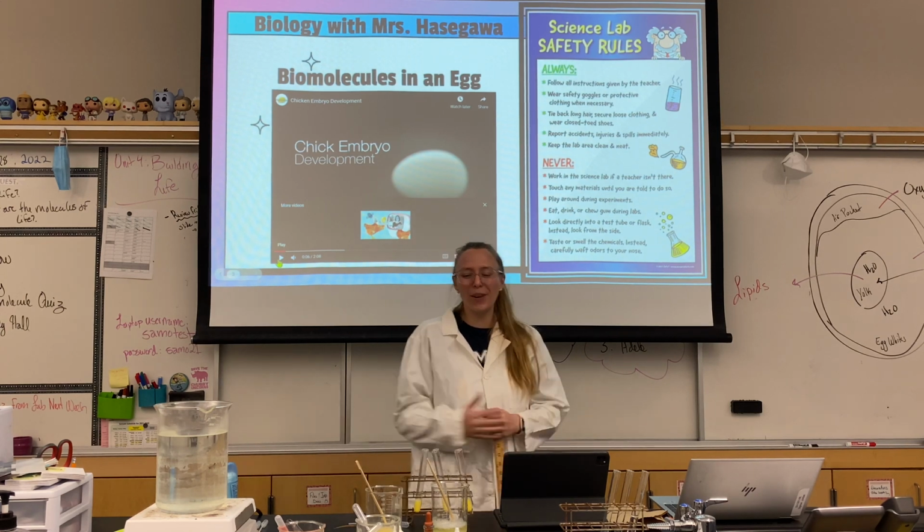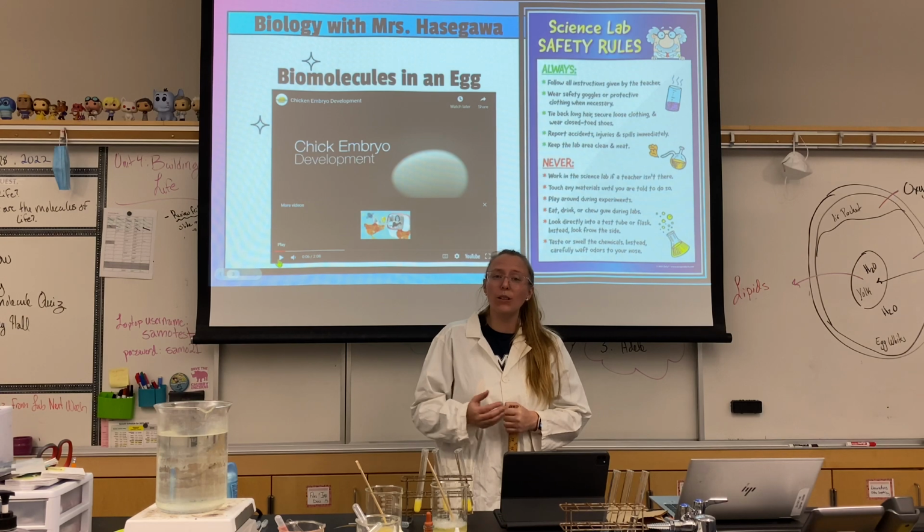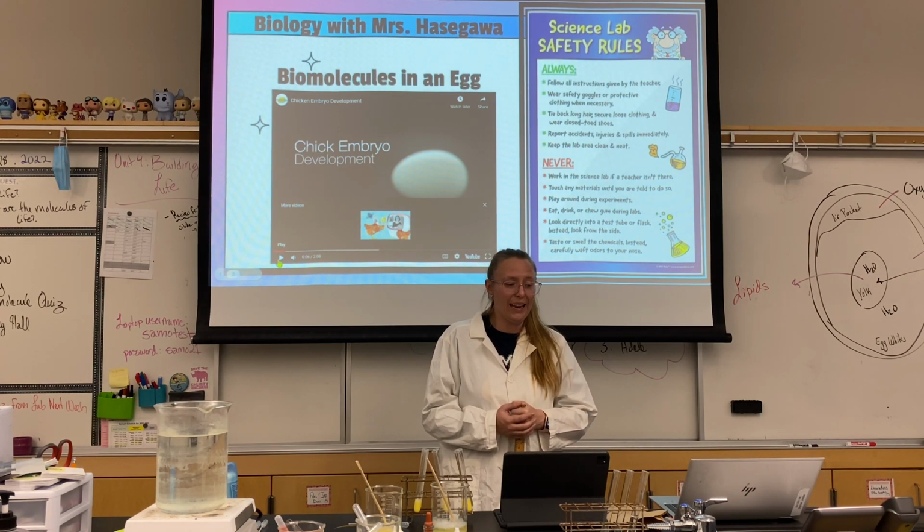So today what we're going to be doing is a lab with a chicken egg, and we're going to be looking to see what kinds of biomolecules are located in an egg.